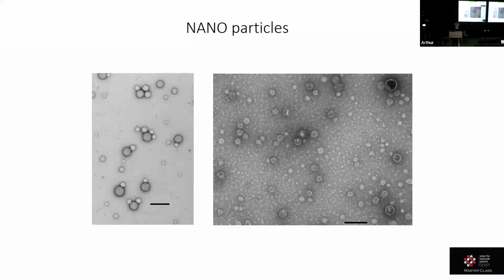What's the scale bar? I don't know. I'm sorry, they're old pictures that I just grabbed out of my file. So your nanoparticle inside is your target, outside is the background, or you say that is probably artifact, this white background, and then these are the particles. Okay. And they're probably 10 to 15 nanometers in diameter.